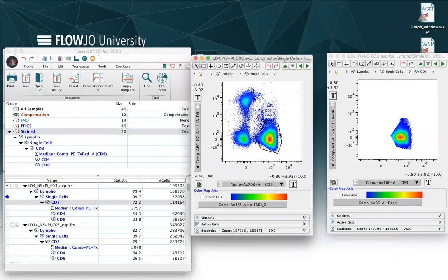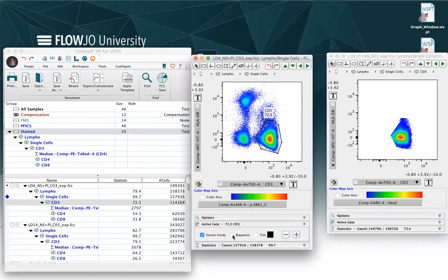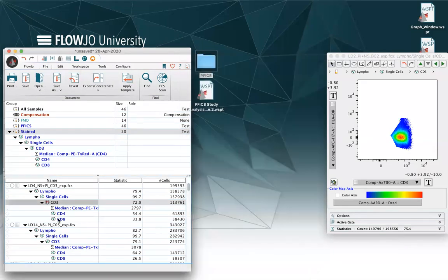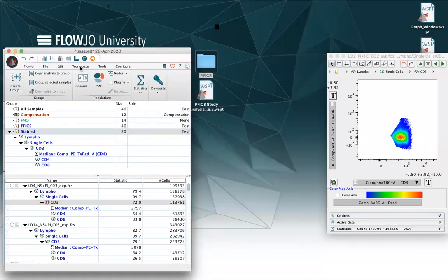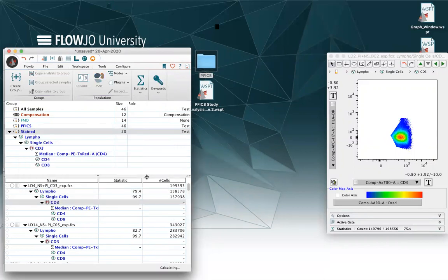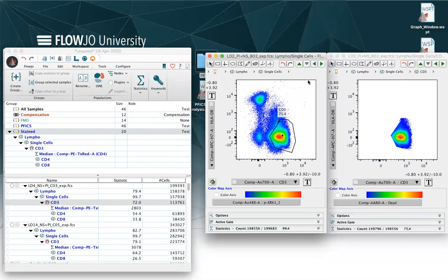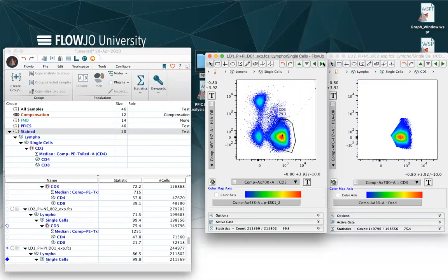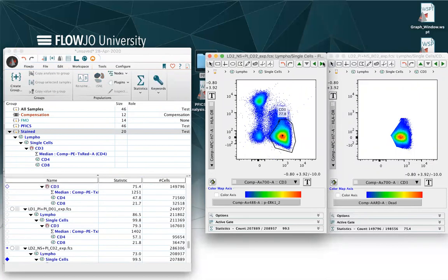I can select my gate, click on active gate, magnetic, and then copy the magnetic gate to the gate, to the group, and then navigate through my samples.